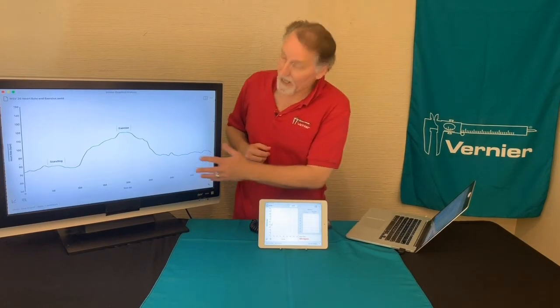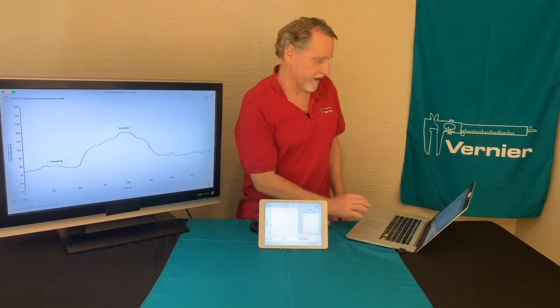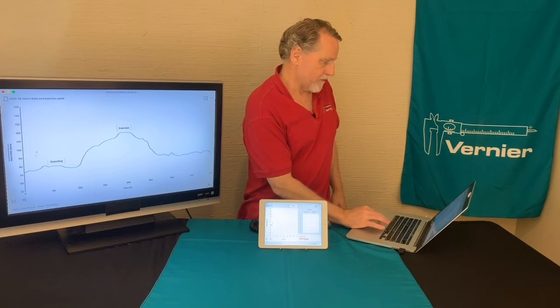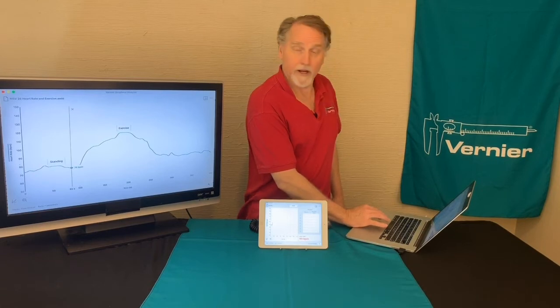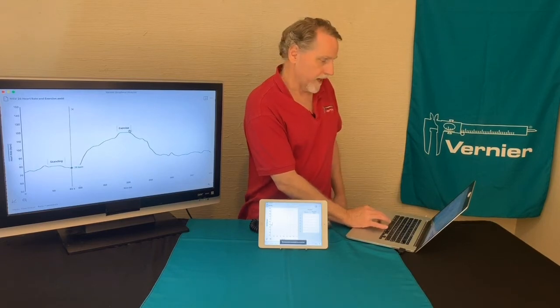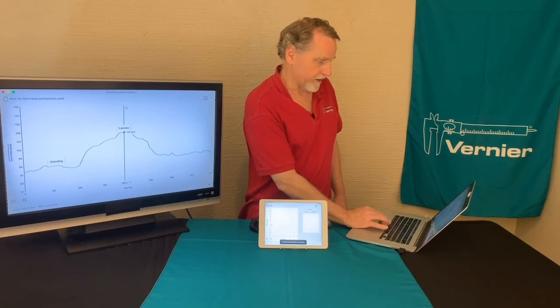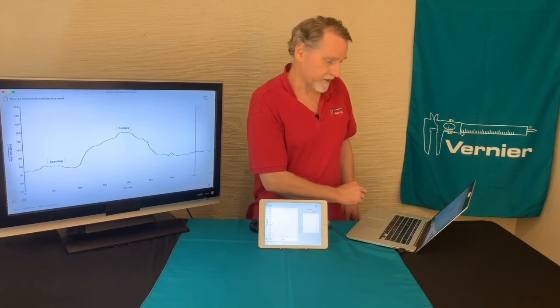Now let's take a look at how you might examine that data if you want to get the rates. You can examine different points along there to get the heart rate — for example, up here it goes up to 115, and down here it gets down to 82.